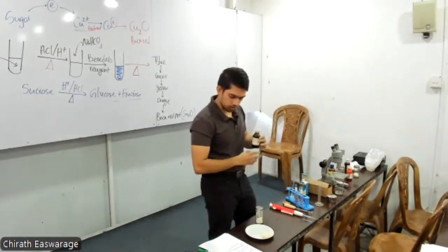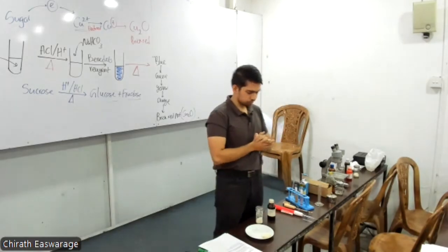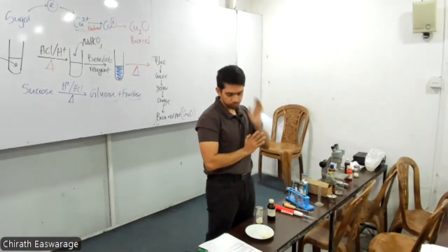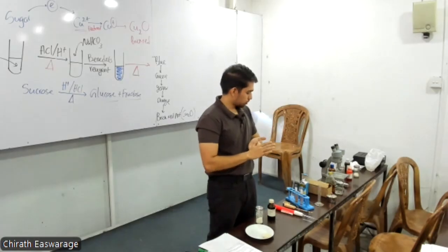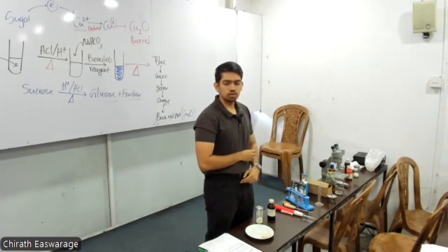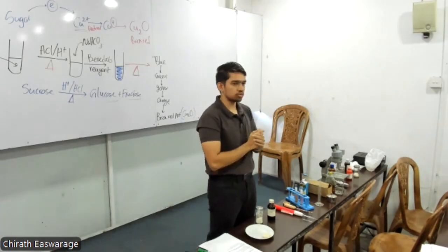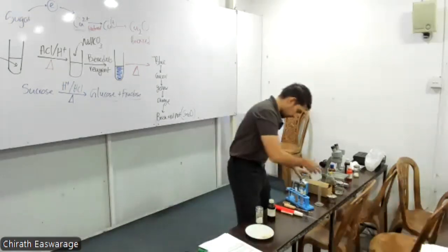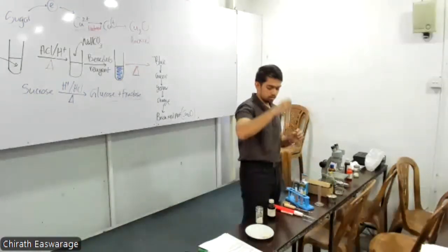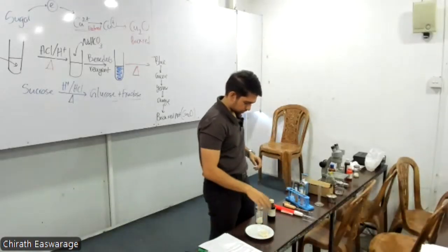What is the color of potassium iodide? You'll see it's yellowish brown. Iodine in potassium iodide is yellowish brown. So what is the color change? If we add it to starch, it's going to give a blue-black color, no? Yeah, a blue-black color change will be observed. Shall we make a starch solution and see? And to the piece of bread directly, let's add.